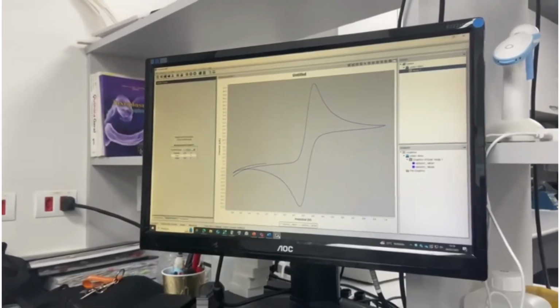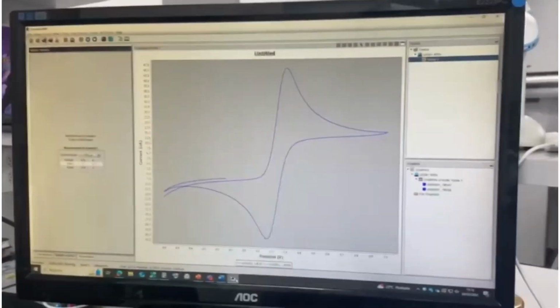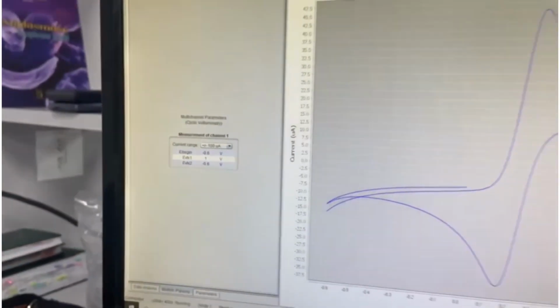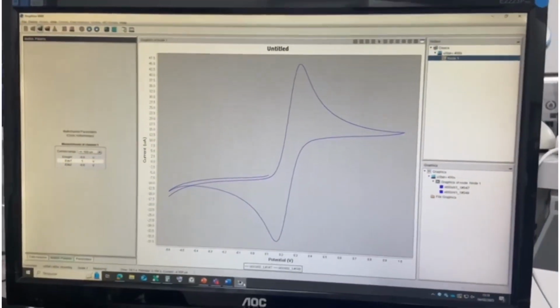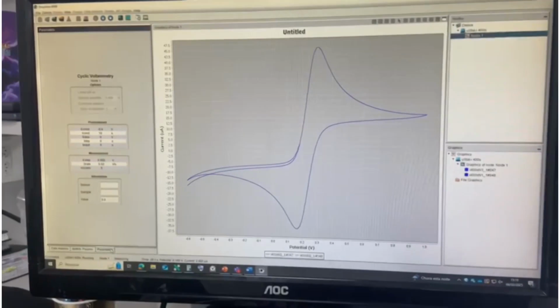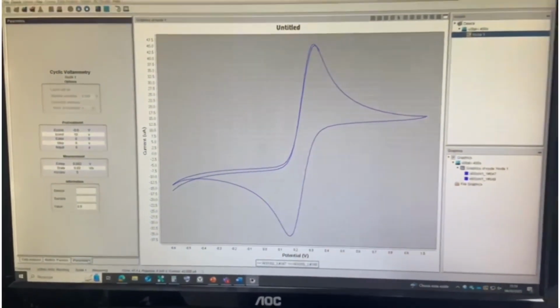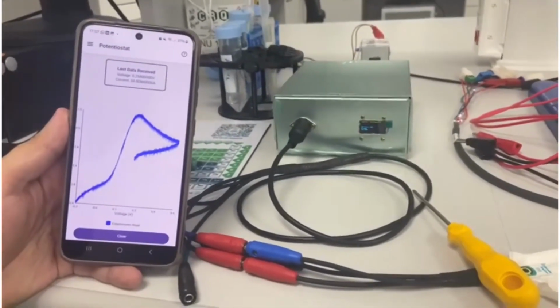We successfully met all mandatory project requirements. We used the Fucus laboratory to compare our potentiostat results with a commercial model. After adjustments to the firmware and application, we achieved satisfactory results, considering the financial limitations and the educational nature of the project.